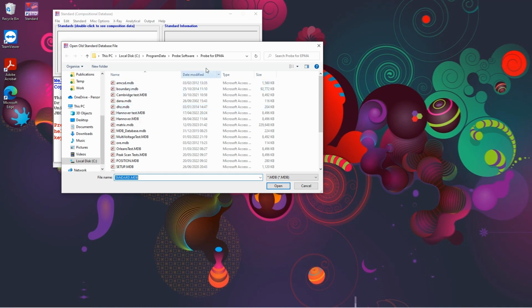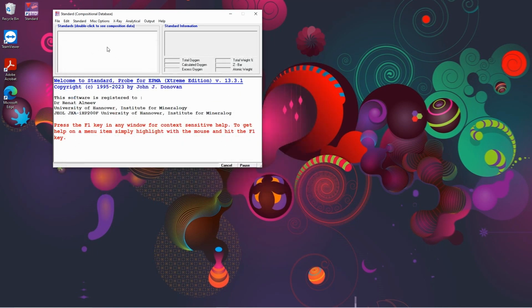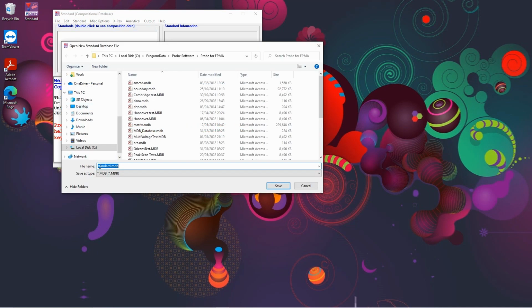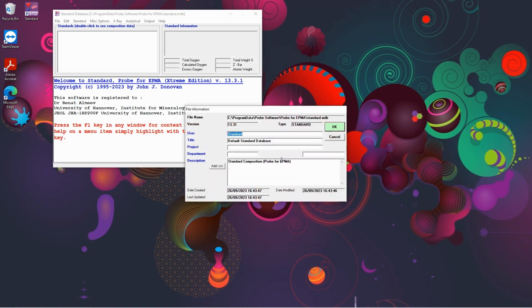Now for this video, I'm going to assume that this is the very first time I'm launching this. So we want to overwrite this standard.mdb. It does actually say standard.mdb. So I'll cancel that and I'll go File, New. And we do want to use standard.mdb because the software requires it to be called that. And we click Save. It'll tell us it already exists and do we want to replace it. Click Confirm to say yes.